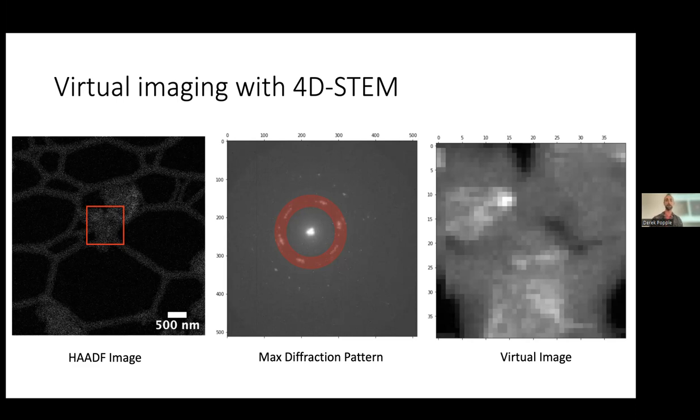In this Python code, you can arbitrarily define an artificial detector and say, okay, now I want to back out another microscopy image only using signal from those specific peaks. By doing that, you can start to create virtual images. Here you can see some cuts in the crystal right in here where you're seeing the black, which represents the vacuum. So that's no sample, that's just unscattered electrons. And then you have similar black regions in here and in here, and you can see that those same features are recovered in the virtual image.